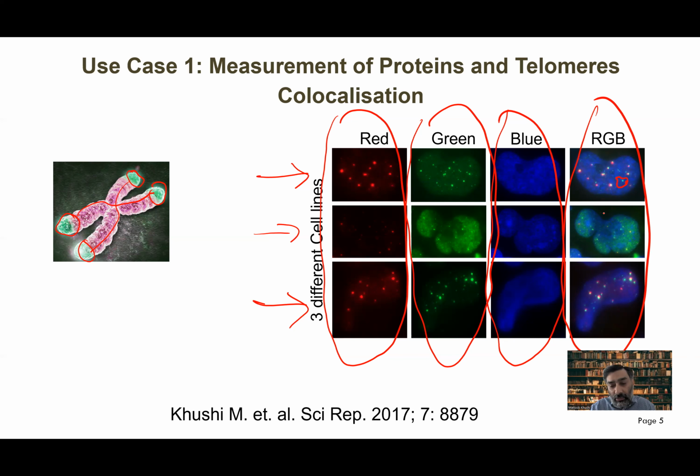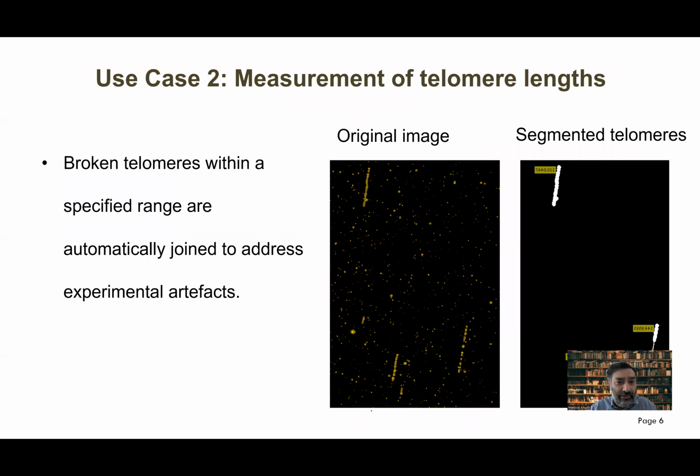So what's the difference? We need to quantify that to say that maybe this is happening more here, maybe this is happening less. And even just saying more or less is not enough. We need to quantify exactly. The whole process is discussed in this research paper in Scientific Reports. People who are interested can read more.